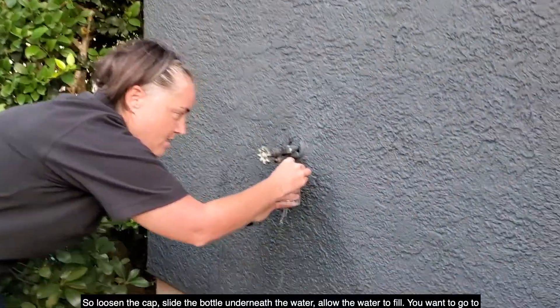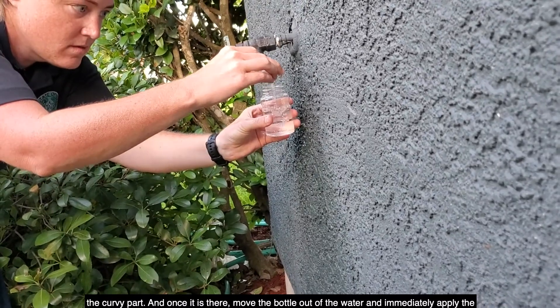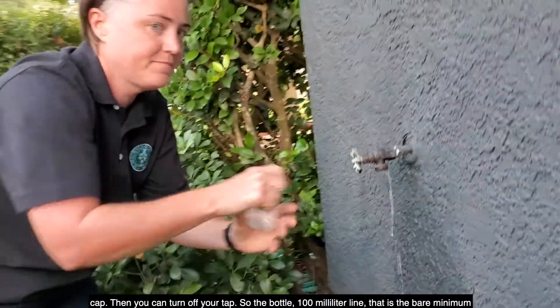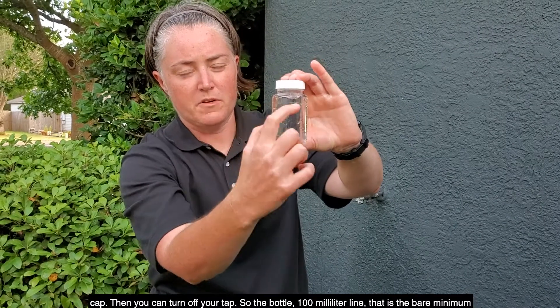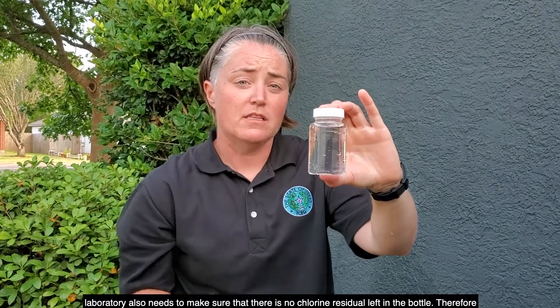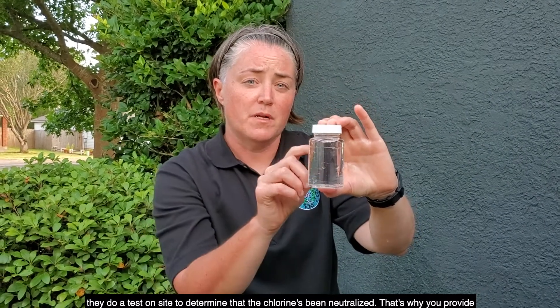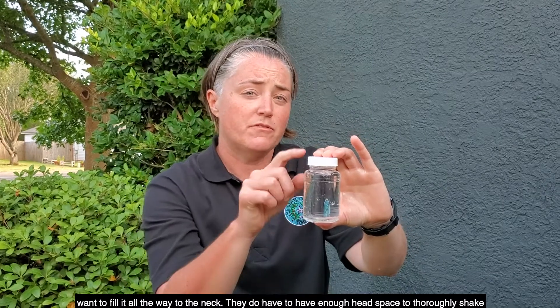Loosen the cap, slide the bottle underneath the water, and allow the water to fill to the curvy part. Once it is there, take the bottle out of the water and immediately apply the cap. Then you can turn off your tap. The 100-milliliter line is the bare minimum requirement for the laboratory to test your water and be a compliant water sample. However, the laboratory also needs to make sure there is no chlorine residual left in the bottle — they do a test on site to determine that the chlorine has been neutralized. That's why you provide additional excess water. However, do not fill it all the way to the neck, as they need enough head space to thoroughly shake the sample. This is an acceptable sample and is ready to go.